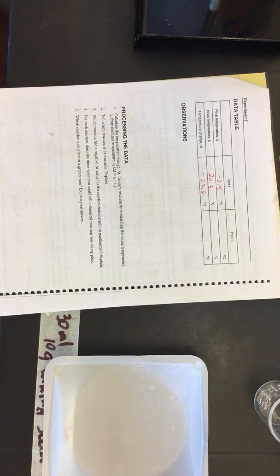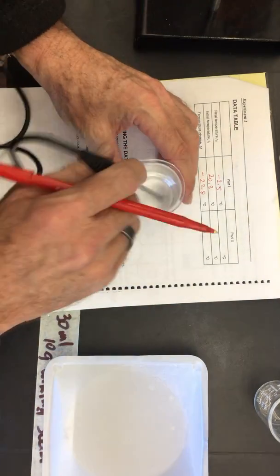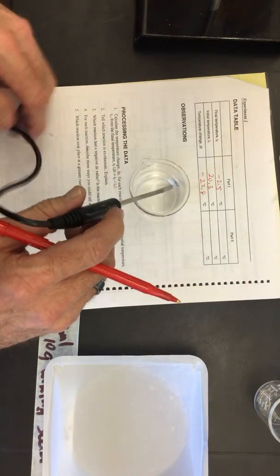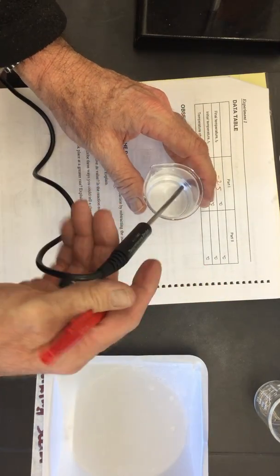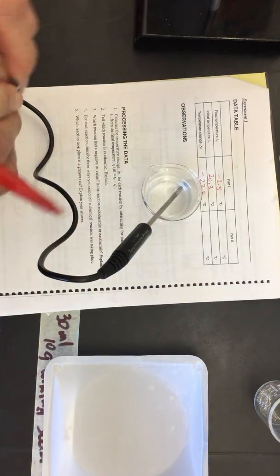Okay, I'm going to go ahead and print this off as well for comparison. And we'll get that later. We're going to go ahead and do the second part of the experiment now. So here is the hydrochloric acid. We need to allow the thermometer to stabilize because it's been in that really cold environment. And we're going to be adding this piece of magnesium.